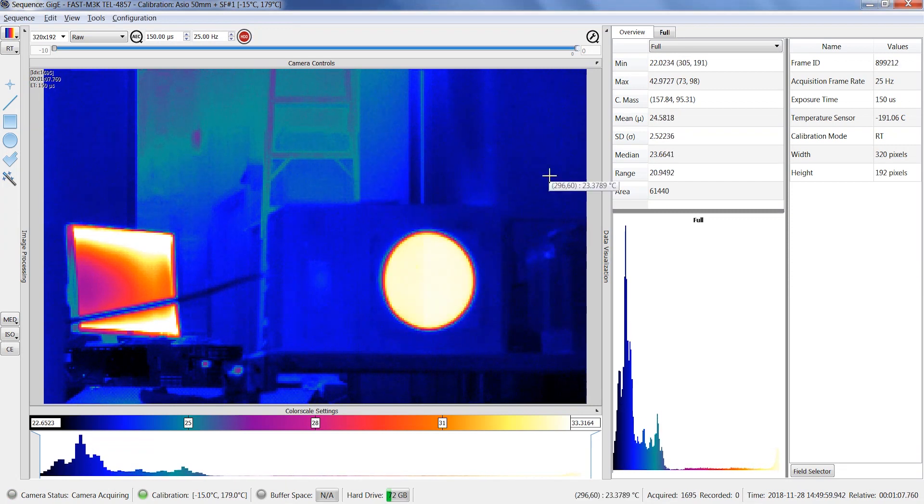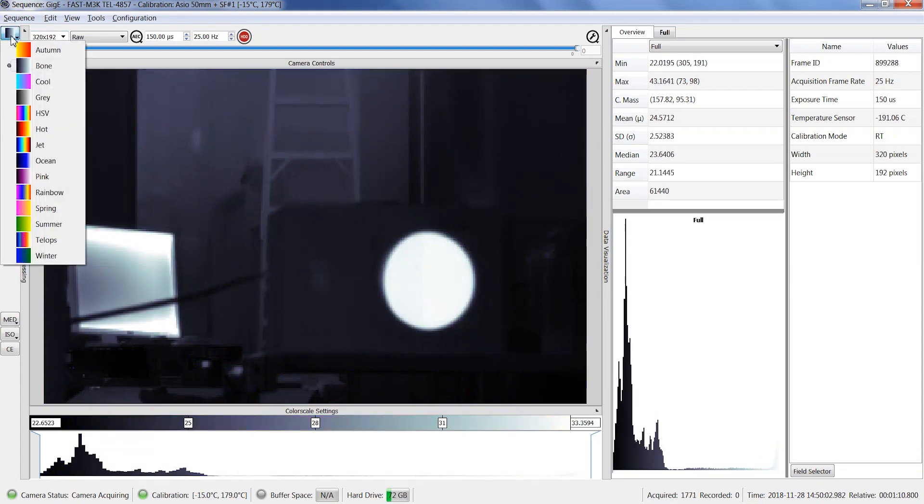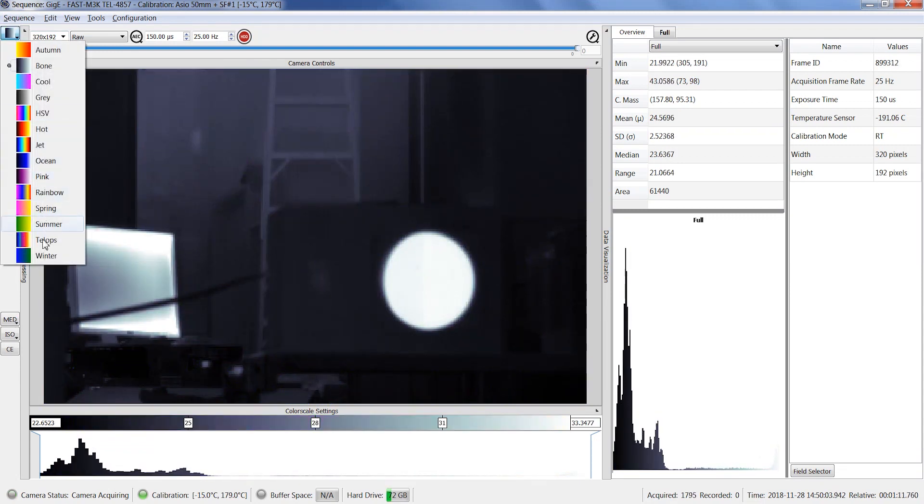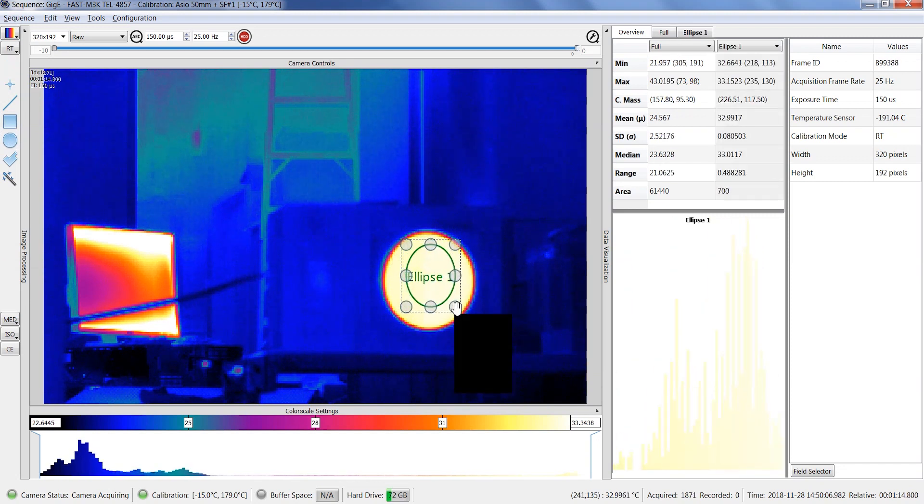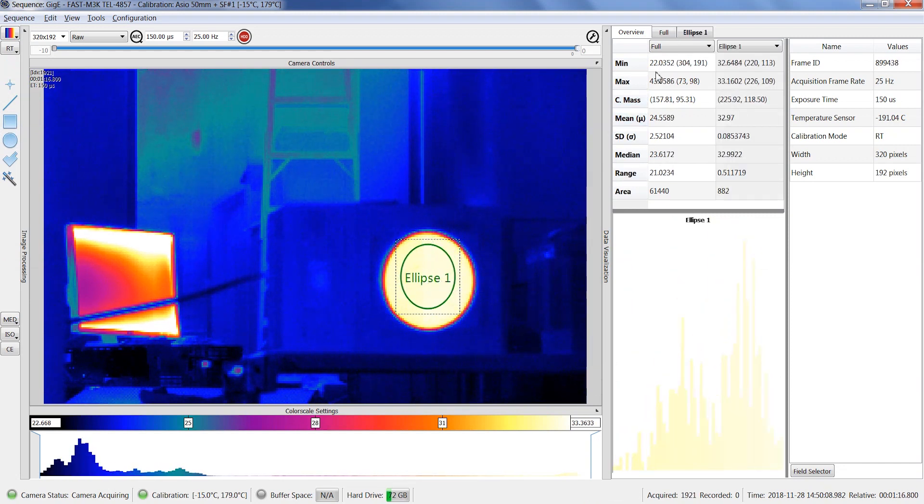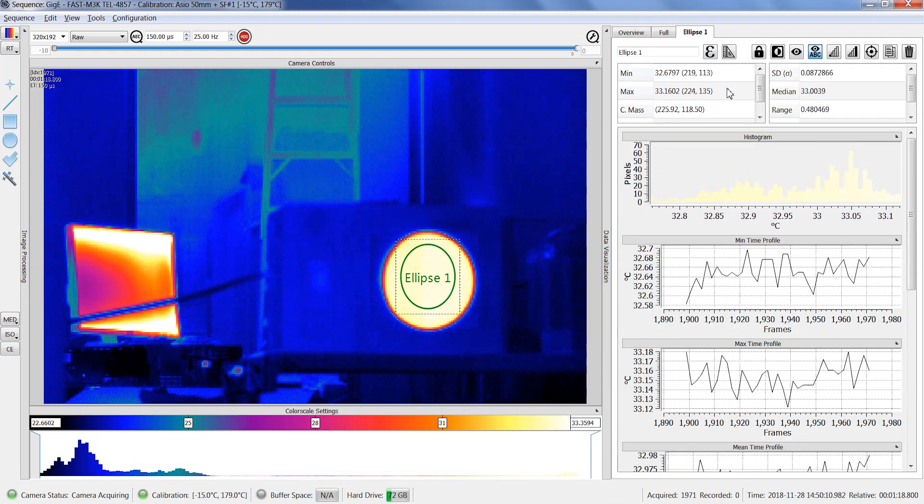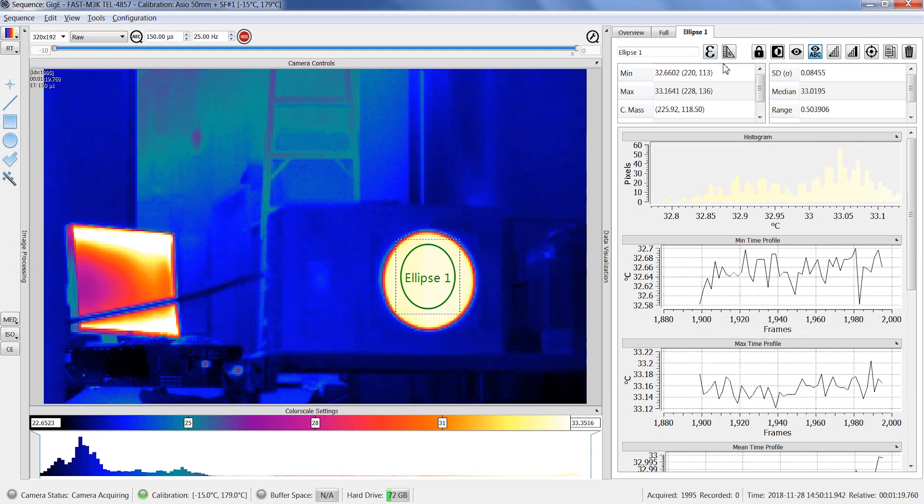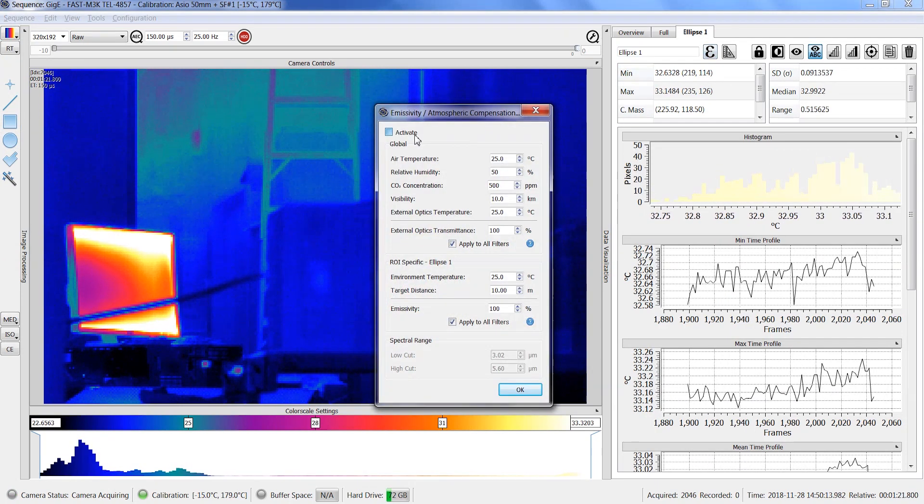You can also change the palette and add several regions of interest just like in the playback mode. For each region of interest, you can see the time profile graph in real-time from the data visualization panel and also apply an emissivity correction in real-time.